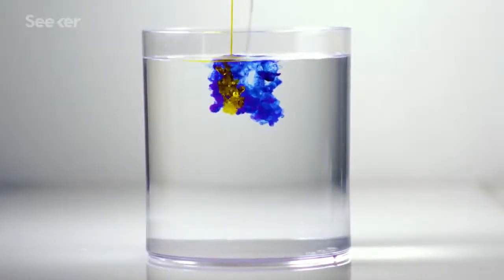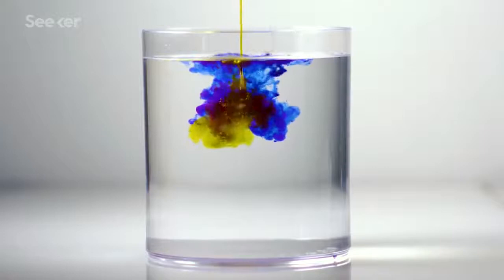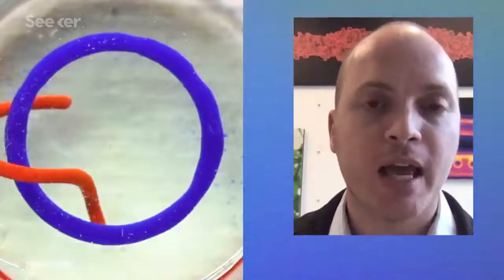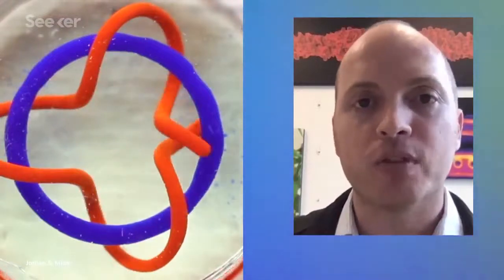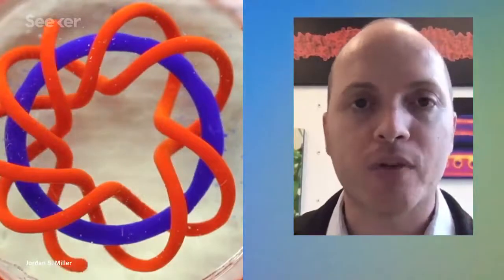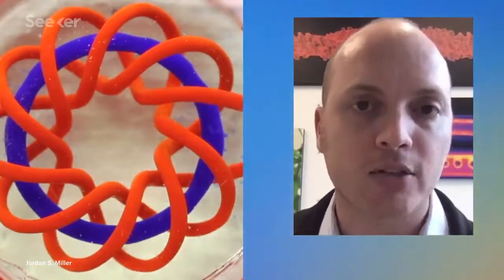But using light also created some issues, since the light could get into previously solidified layers, thus disrupting the intended pattern. To address this, the team searched to find an element that could block light and that was biocompatible. And the winner was food dye. These biocompatible food additives that all of us are eating all the time anyway, we already know that they're biocompatible. They're compatible with live cells, and they can be used as potent photoabsorbers to block the light penetrating previous layers, getting us our complex architecture.